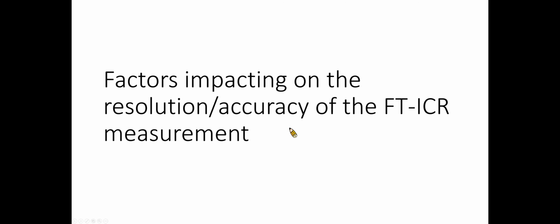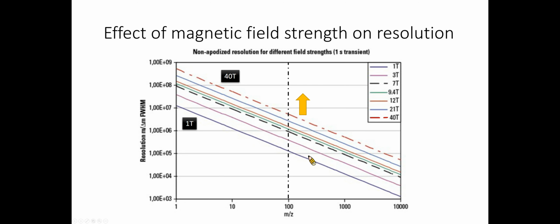We talk about the resolution. So what are the factors that can impact the resolution of the FT-ICR measurements? The first factor that comes into play is the strength of magnetic field. The stronger the magnetic field, we will have a higher resolution.